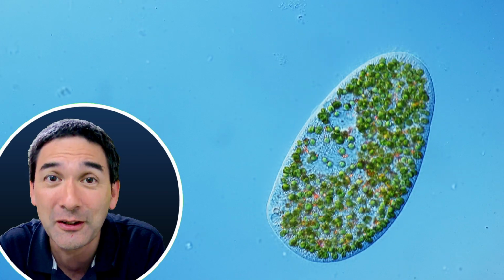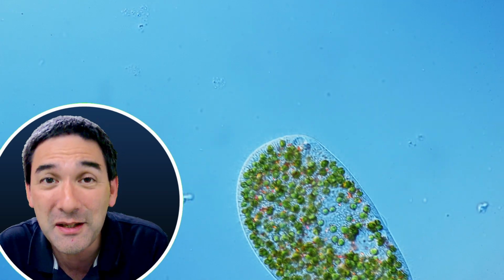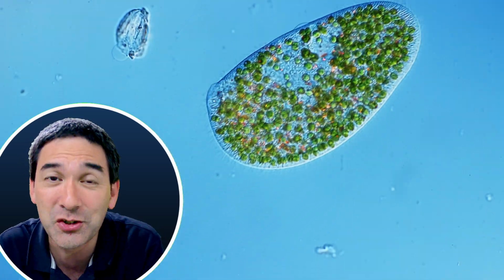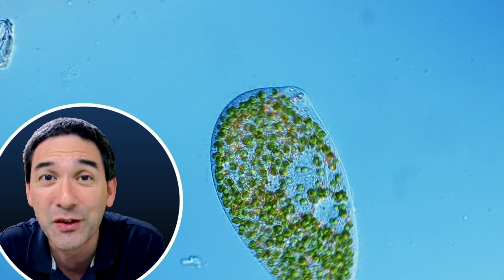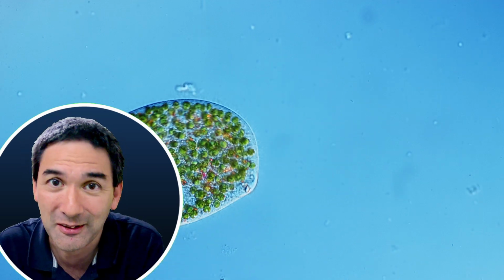So what we see here is actually endosymbiosis on two different levels. It is the Paramecium which carries the Chlorella algae, and the Chlorella algae which carries the chloroplasts, which were once also photosynthetic bacteria. So it's essentially a cell inside a cell inside a cell.